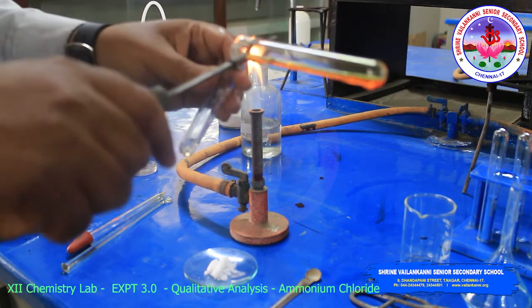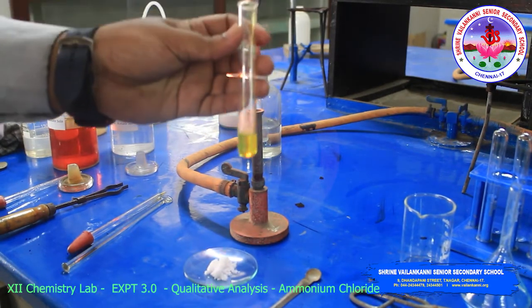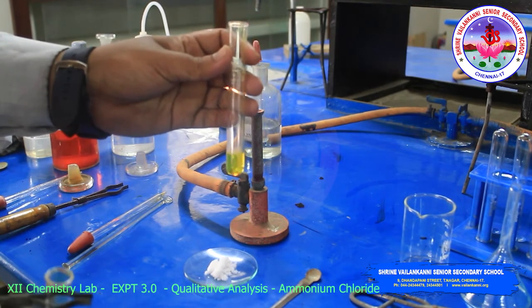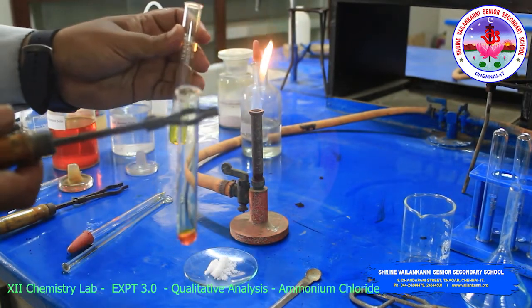Now the solution turns yellow, so this indicates what? The chloride is confirmed. Then the lead acetate solution is added to the above solution, and the yellow precipitate is formed.